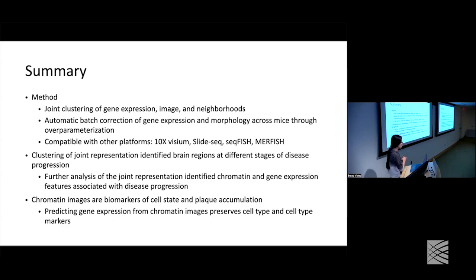If you're interested in trying our method out, it's on GitHub. We have one notebook for in situ sequencing data using STARmap. We also have one demonstration using 10x Xenium, a demo on the demo data of 10x Xenium with the brain samples.